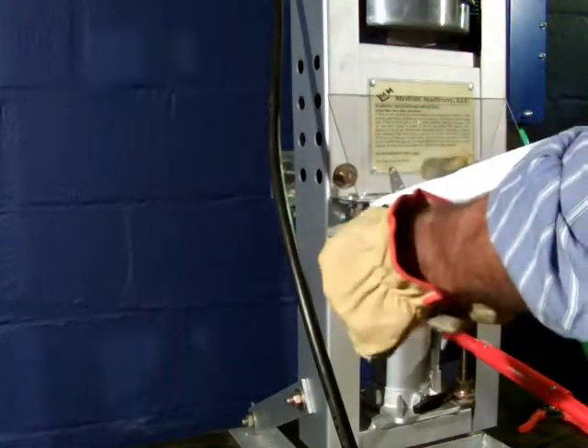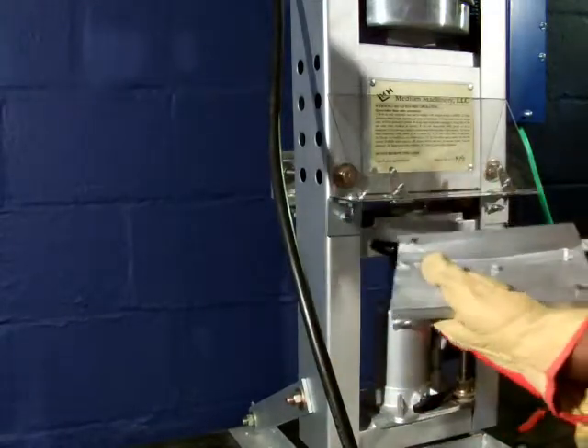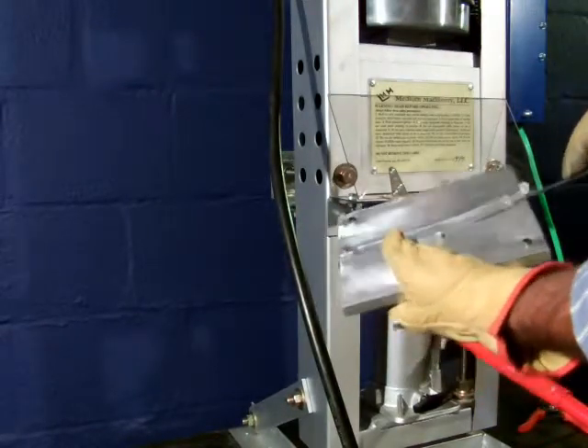To remove the part, just pull on these tabs right here. That's another advantage to having the release openings — they actually function as tabs to pull the part off the cavity.